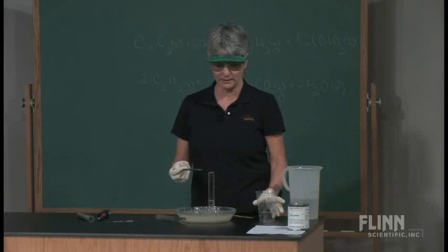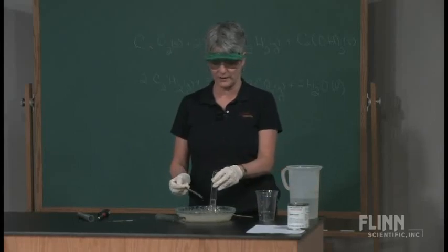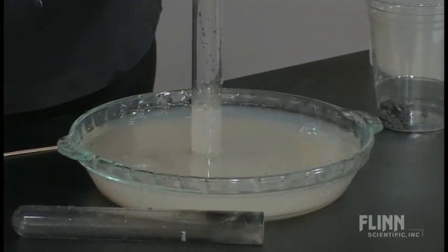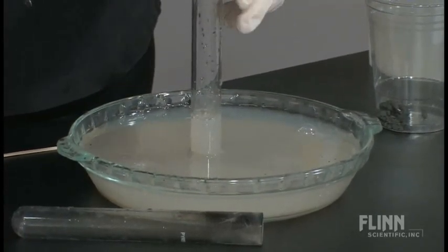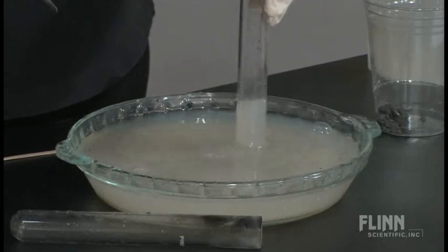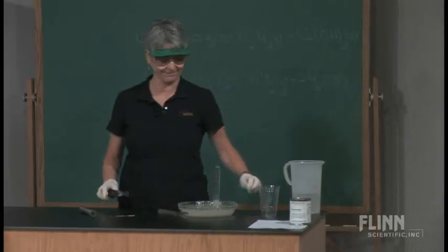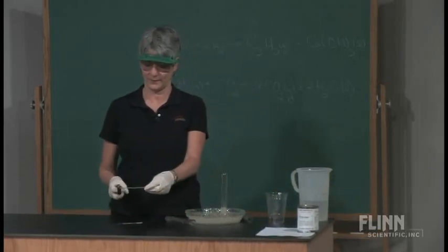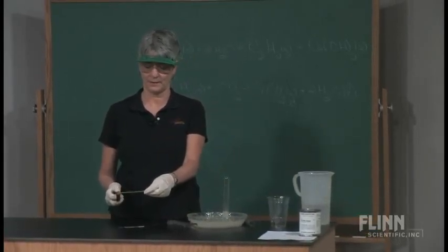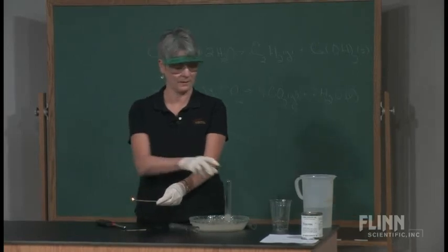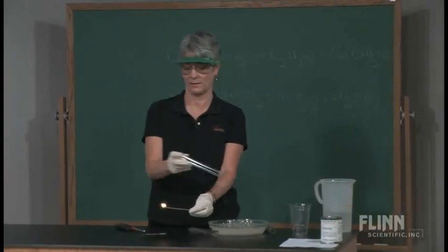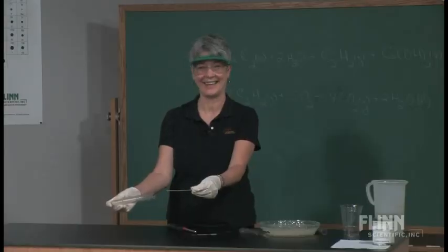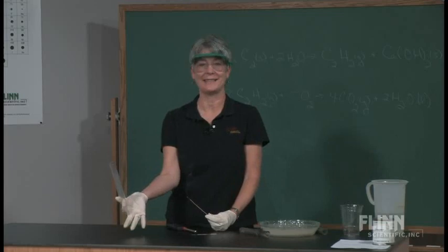And it's kind of by feel in terms of how much you have to collect. Having done this a few times, let's see if I got that one right. Okay. And notice how clean that test tube is.